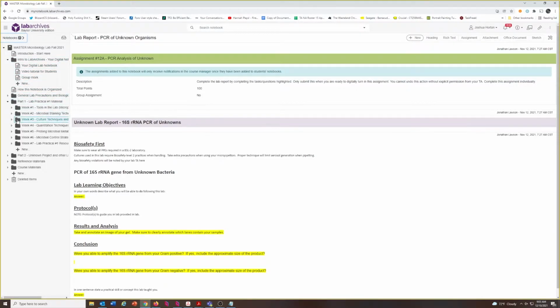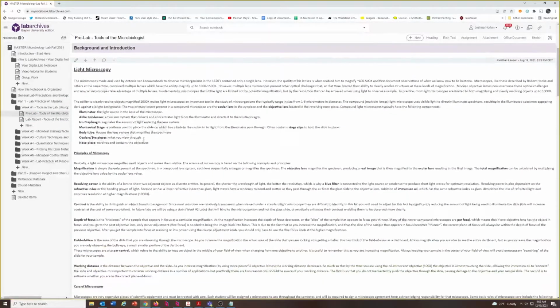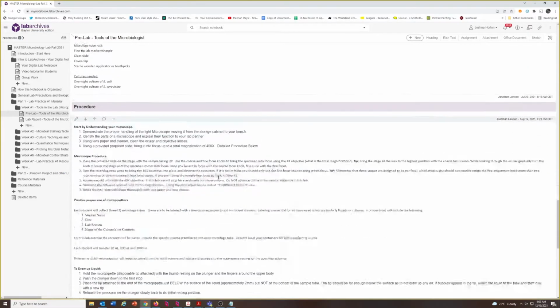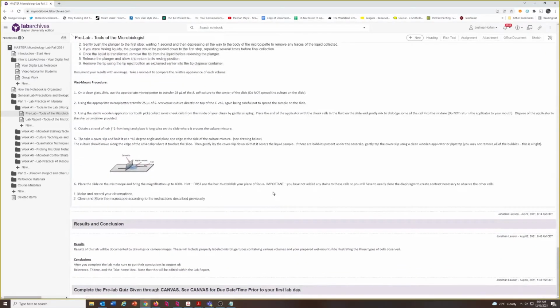Most importantly, I want to talk about submitting lab reports and viewing lab report information. We'll start with things like general lab precautions and biological safety. That'll be our very first day. But when you guys actually turn in lab reports and things like that, what you're going to want to do is click over on the first one, which is pre-lab report, and you can read through all the information that's covered in there. It has things like background information, any specific things, videos, materials you'll need for the lab, the exact procedures and the order that you'll be doing them in. This is important to make sure that you guys have ready and available.